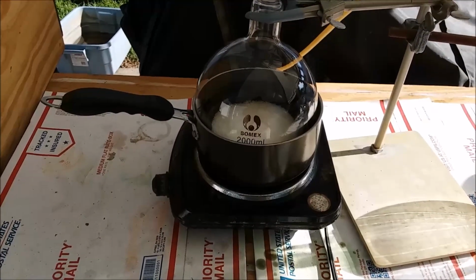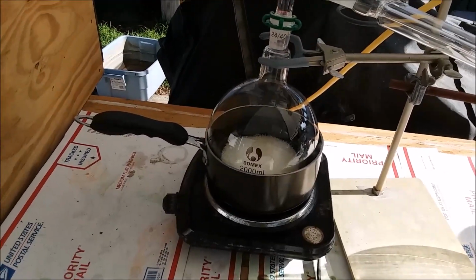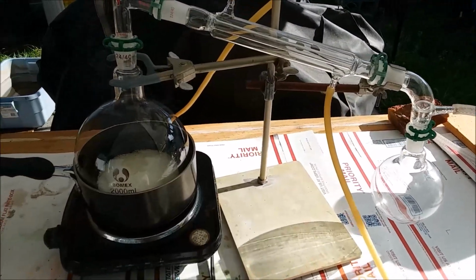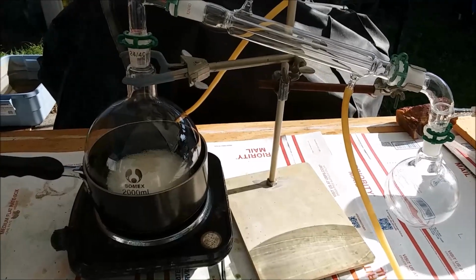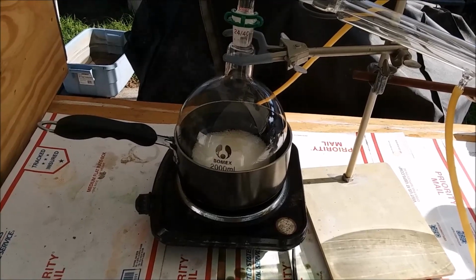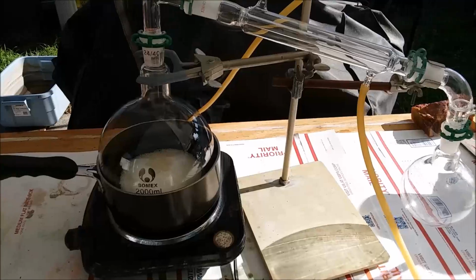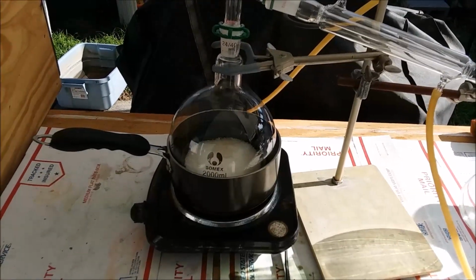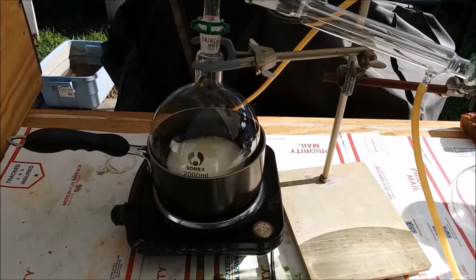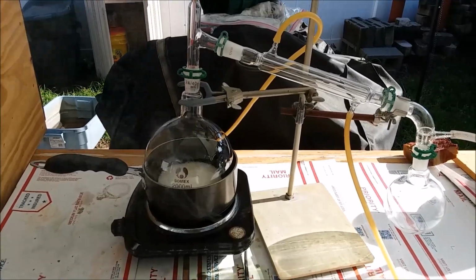It looks like I dribbled a little oil on the heating element because it's smoking a little bit as it's heating up. So we'll see how this goes. What I will probably do, after the end of this run with this flask, is swap out my smaller 1-liter flask with another fresh batch of reactants and keep the distillation going, so I get more than double the amount of nitric acid on this run, because nitric acid is just so damn useful.